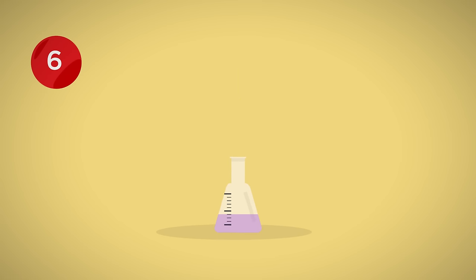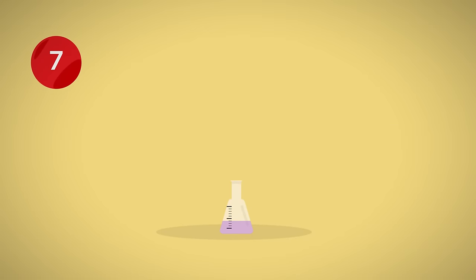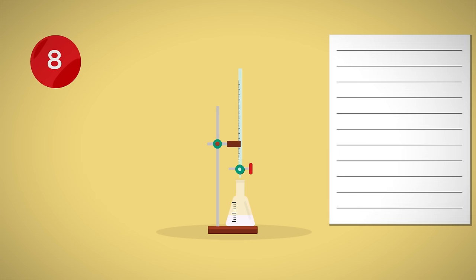6. You may need to swirl the flask to mix or use a stir plate. 7. Stop adding when the reaction is complete. The endpoint is reached. This is where an indicator may help because there would be an appropriate color change. 8. Record the final volume.